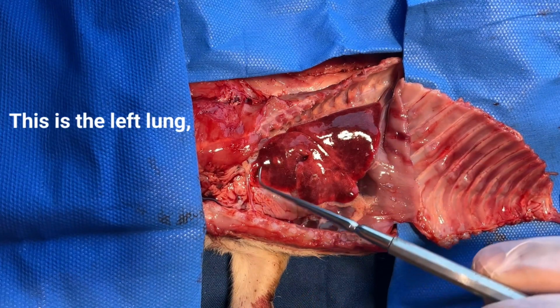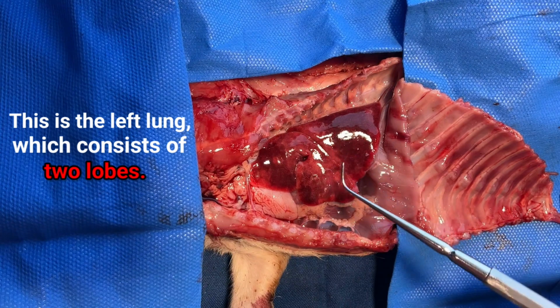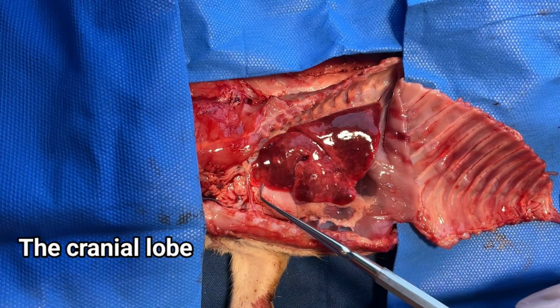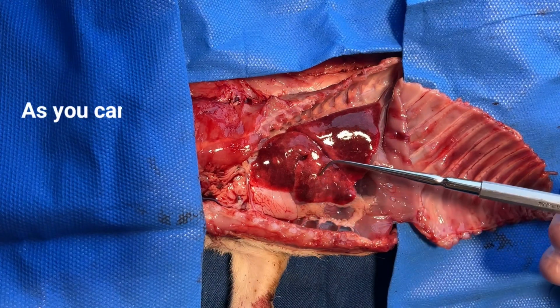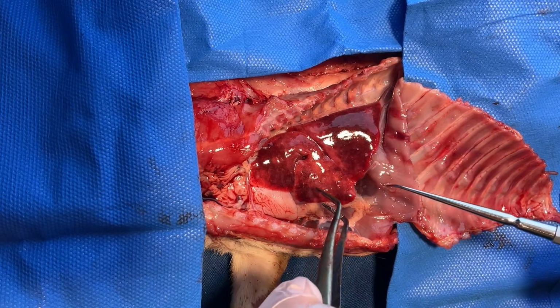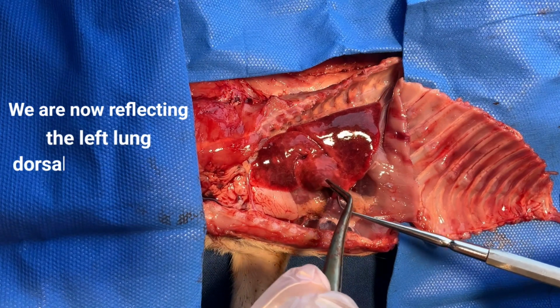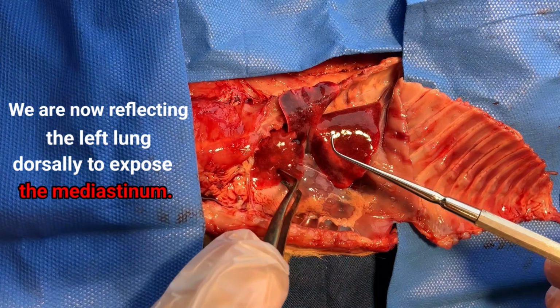This is the left lung, which consists of two lobes, the cranial lobe and the caudal lobe. As you can see, the cranial lobe is divided into two parts. The caudal lobe, however, is undivided. We are now reflecting the left lung dorsally to expose the mediastinum.